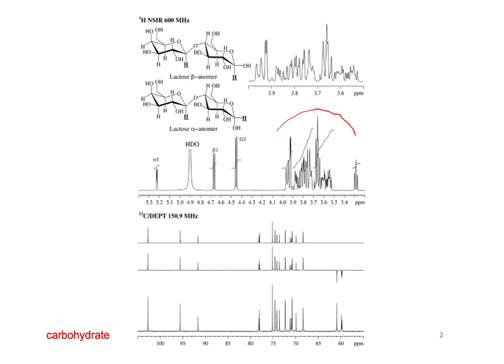What also makes this complicated is that this is a mixture of two different anomers, we'd call it. So notice in these two structures, they're both called beta lactose, or they're all called lactose. This is a galactose, I think, here, and this is a glucose here that are hooked together. This is the anomeric position where they're connected together, and if the oxygen is going up, this is called a beta anomer.